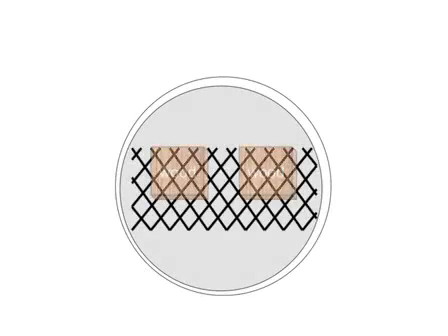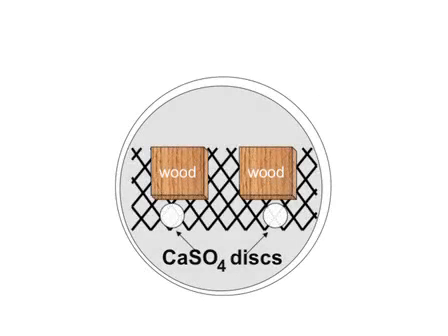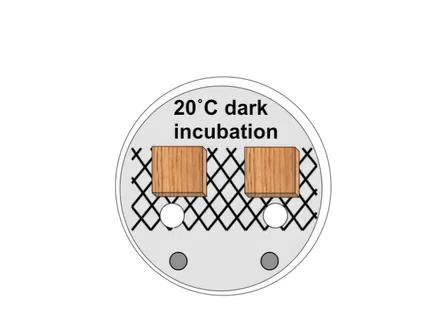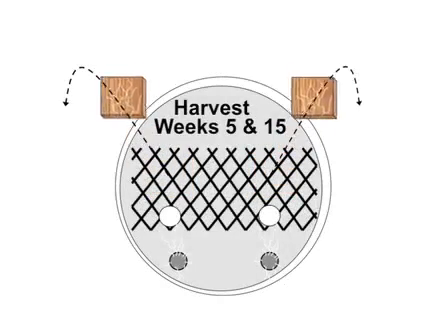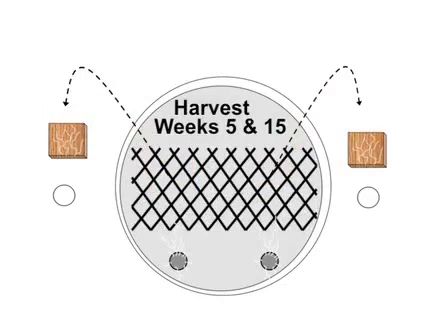Then, the wood to be degraded and any exogenous solid substrates are assembled on top of a plastic grid on the agar surface without allowing contact among substrates. The microcosm is then inoculated and incubated with the test fungus. Following incubation, wood blocks are harvested to determine mass loss and to prepare tissues for analyses.